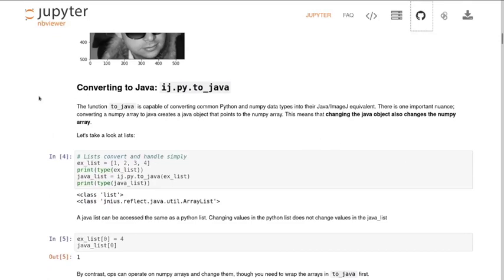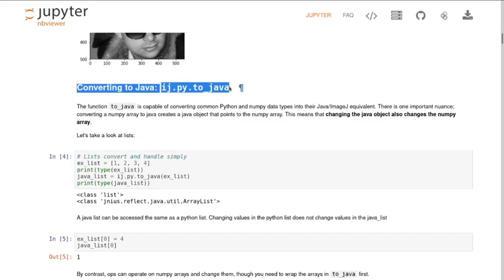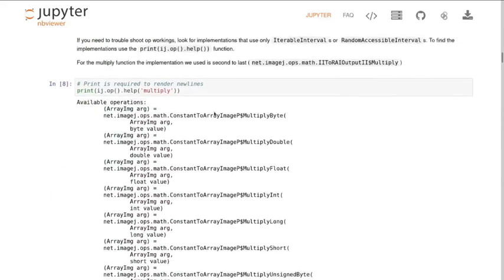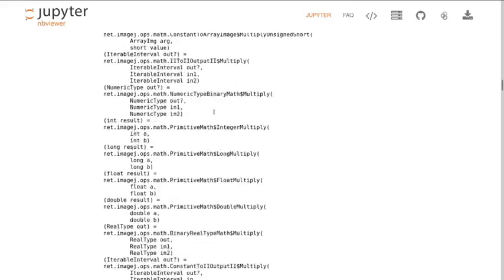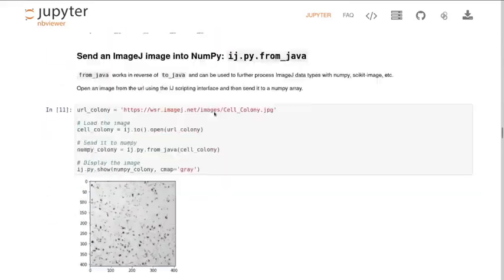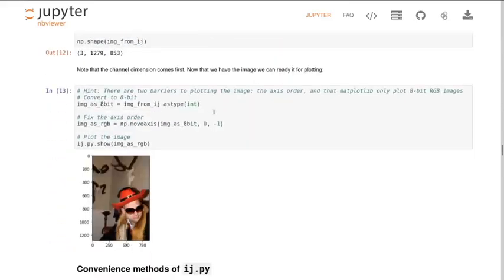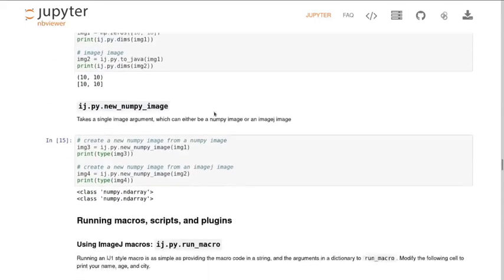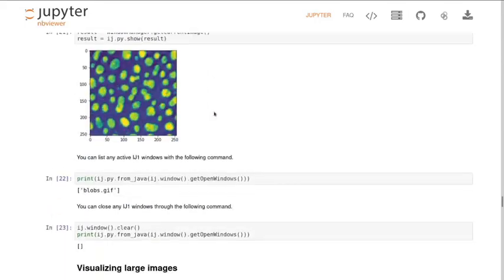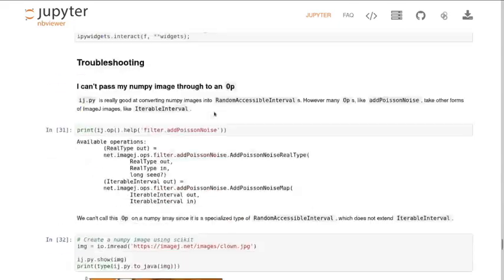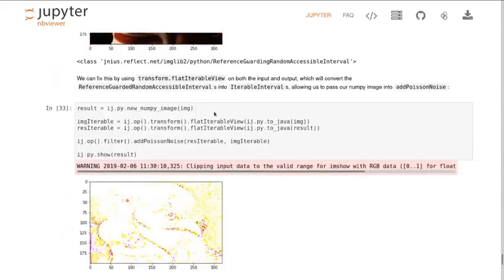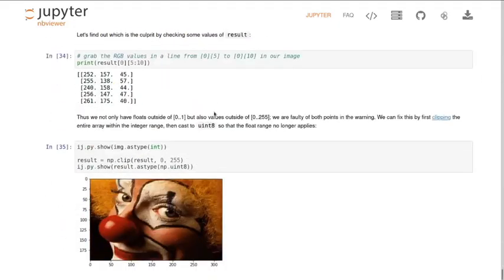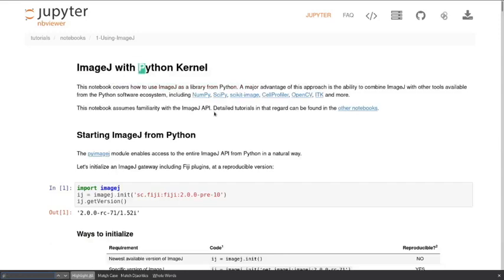So the annoying thing about interacting with ImageJ from within a Python environment is that the way Python stores and looks at data, and the way Java stores and looks at data is quite different. We imagine a long pipeline. You've got a load of images. For each image, you want to load it, do some preprocessing with scikit-image.